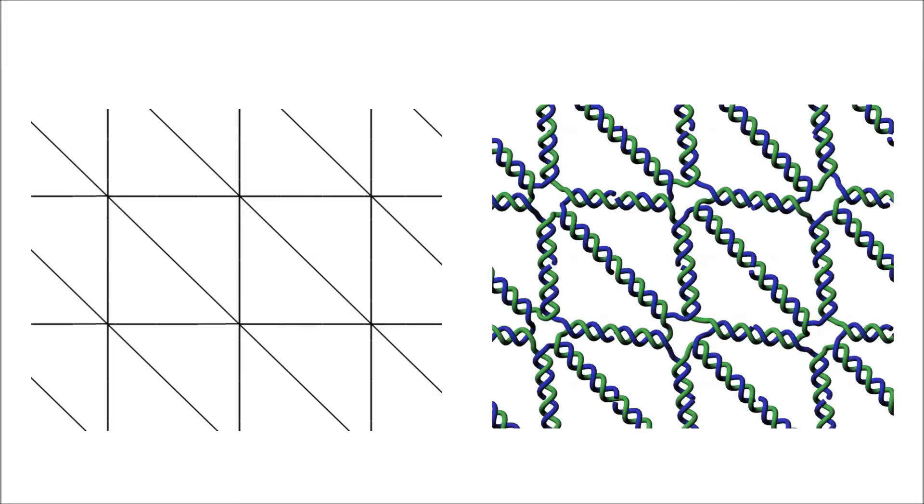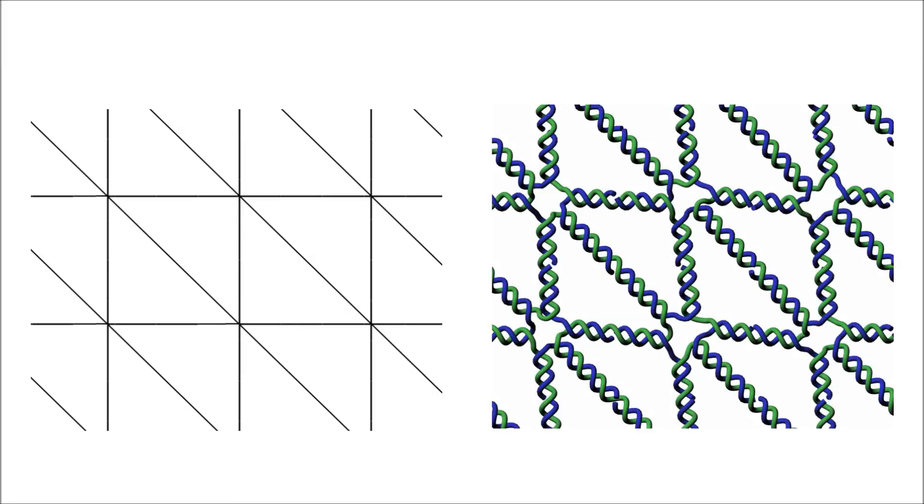Here to the left we see a segment of a mesh, and to the right we see the DNA representation of the same mesh segment. The mesh consists of the scaffold strand in green traversing every edge of the mesh, and the staple strands in blue binding the mesh together at the vertices.